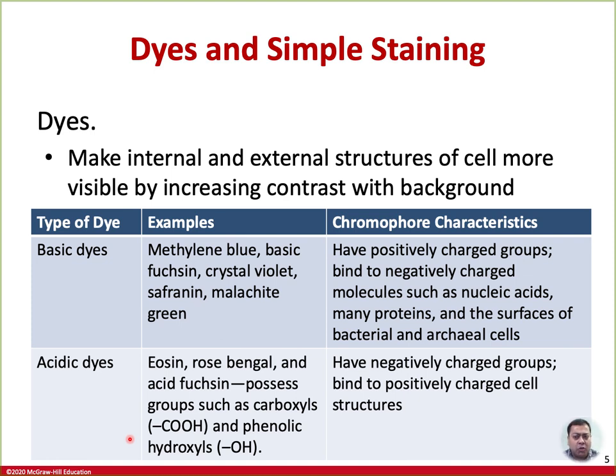Now, this is a new term that I'm talking about. This has nothing to do with the charge. Negative staining is essentially using an acidic dye to stain the glass slide, where the organism will appear clear against a uniformly stained background. And we are going to talk about that later.